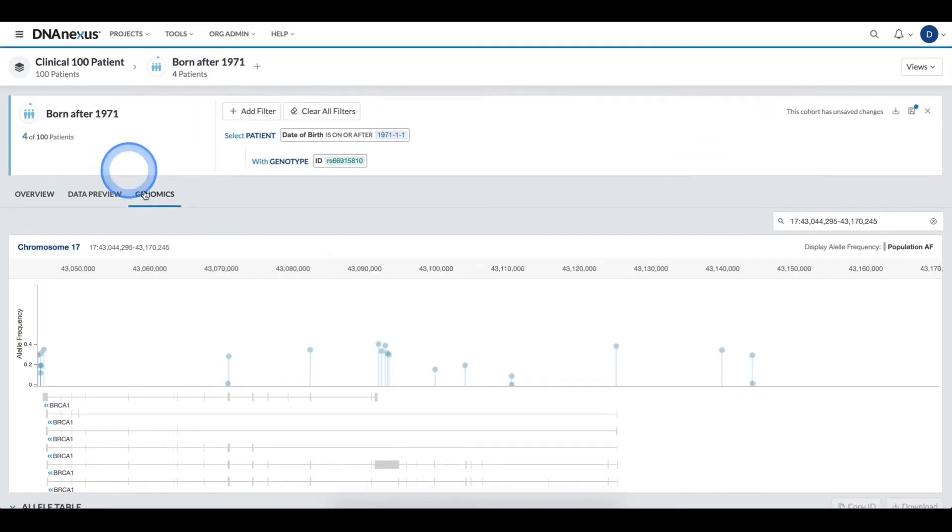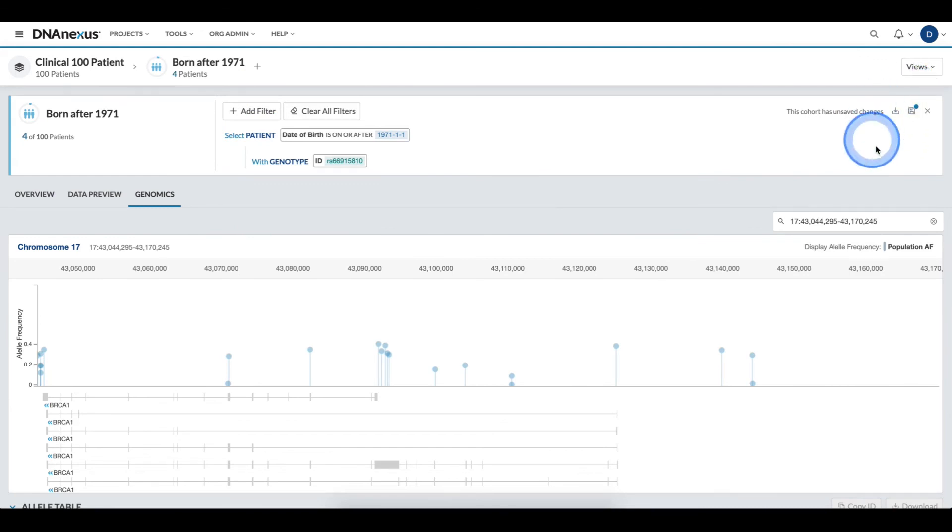With this cohort definition, I can then save if I am satisfied with the criteria and pass it to downstream analysis.